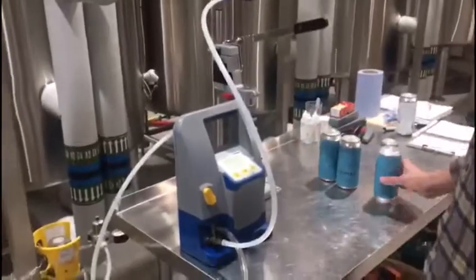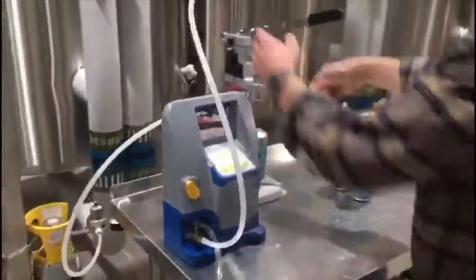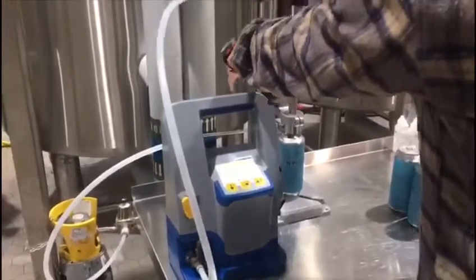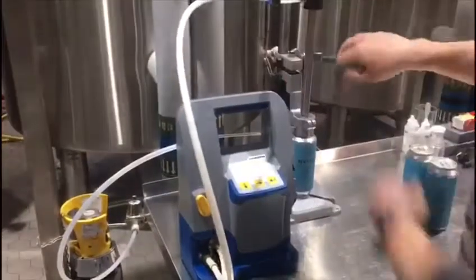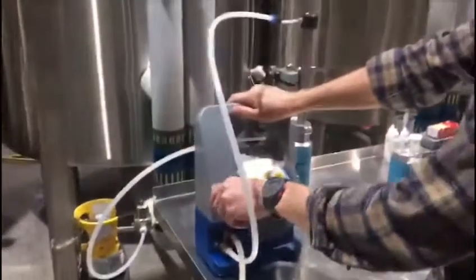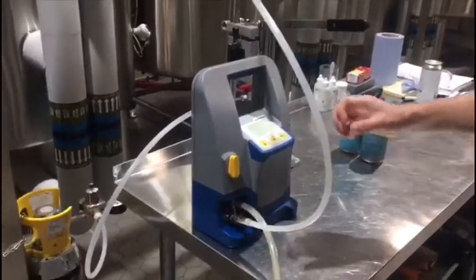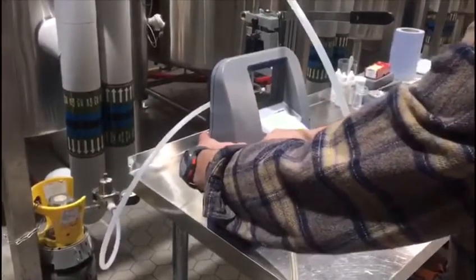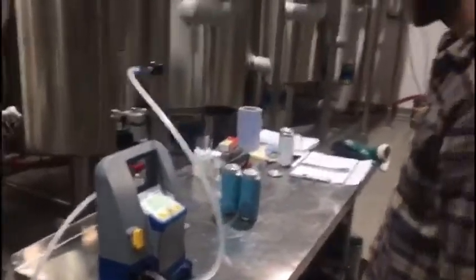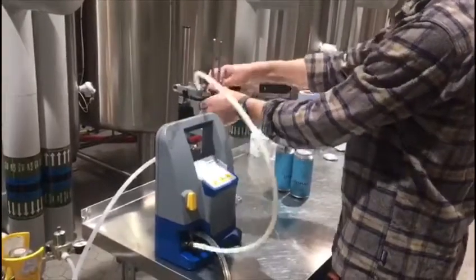We've got a piercer here. We shake the cans for a minute and place them under the piercer, then pierce the first can and start by sending some CO2 through the machine. We're going to restrict the flow on the DO meter because the chamber is quite large and the tube size is quite large — you need it to run pretty slow to get an accurate measurement. After running that for a few seconds, we'll put the plunger into the beer and start measuring.